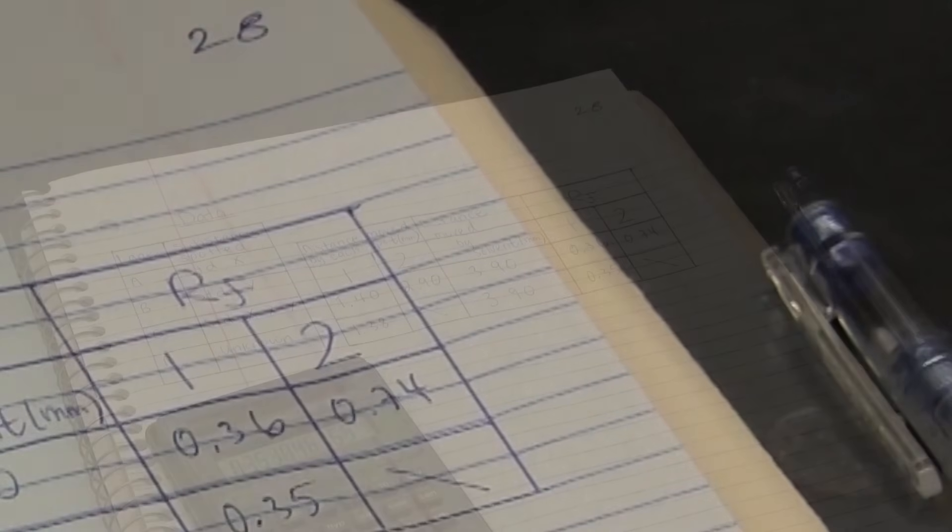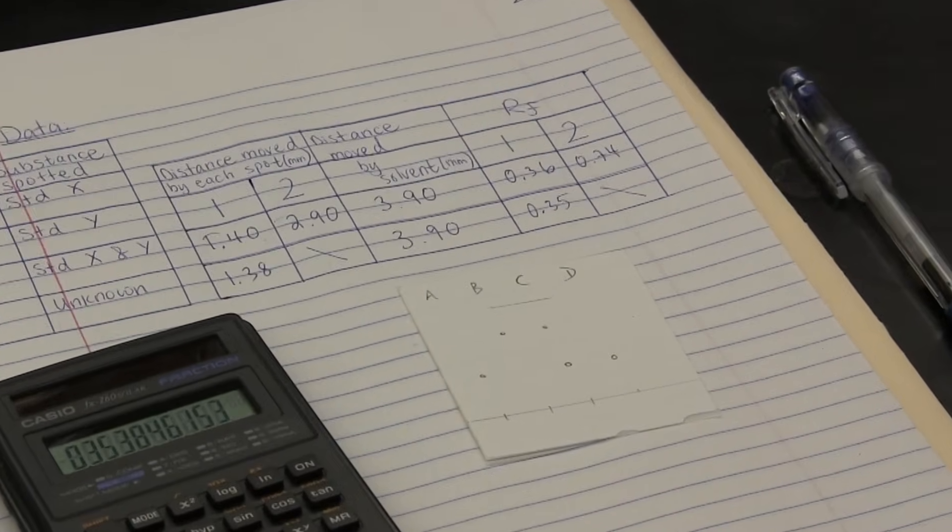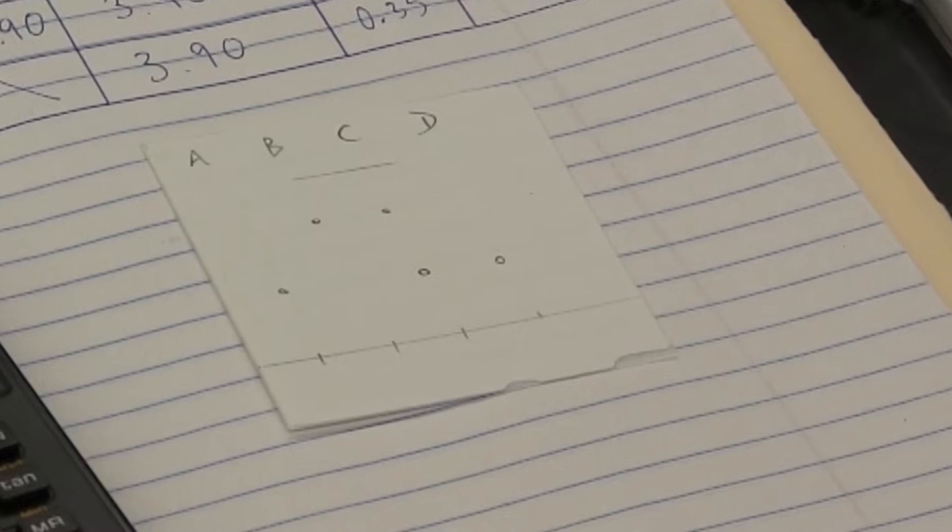The closer the RF value of an unknown is to the RF value of a standard, the greater the chance that the unknown is the same as the standard. This is what allows us to identify unknowns in mixtures by comparing RF values of the unknowns with those of standards. It's unlikely that RF values of analytes will exactly match those of the standards to the second decimal place. This is due to combination of experimental error arising from various factors including measurement uncertainties and inconsistencies in the TLC plate.